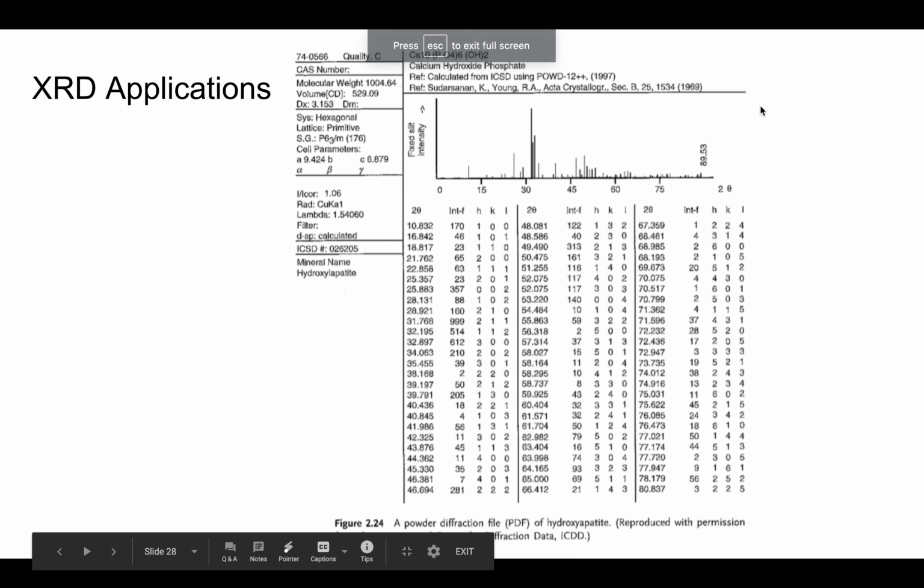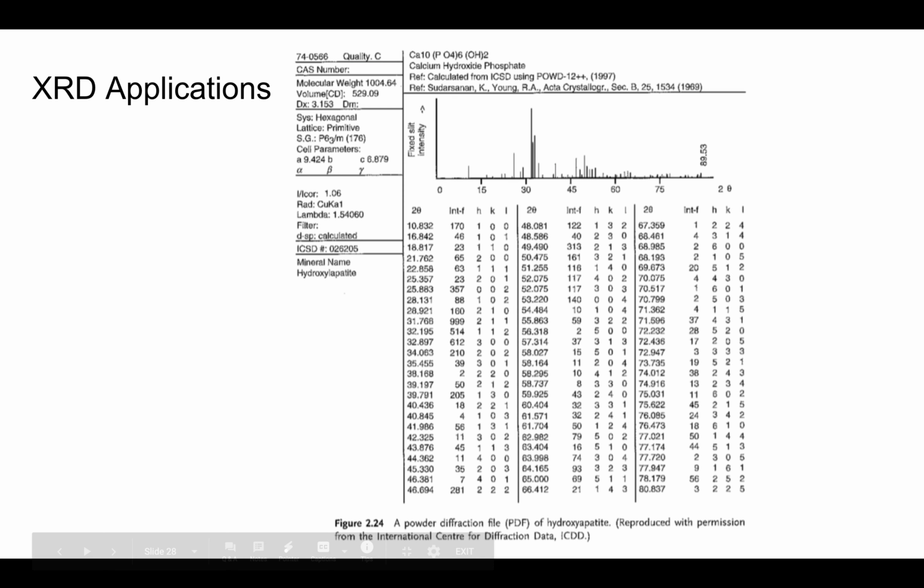All right, in this module, we're going to start talking about how we start to do useful things with the X-ray diffraction data and what that looks like. So the first thing we can do, obviously, if we have crystalline phases in a specimen, we want to get the crystal structure and information about that. And we can do that by comparing two archived diffraction spectrum.